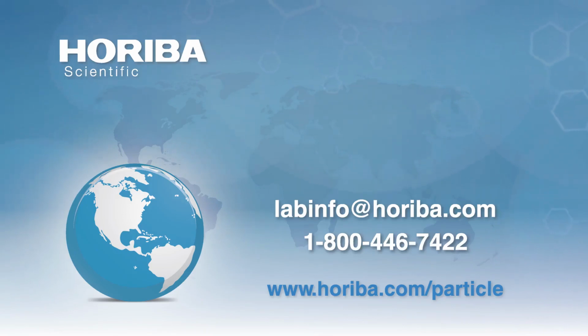Yes. So, if you have an aqueous solution and it contains a strongly absorbing molecule in it, I think vitamin B does this to me. It absorbs strongly, I think it absorbs the blue or the green, I forget which. And so you might be forced to turn down the laser power because of that. That doesn't happen a whole lot. A more common request we get is with an organic liquid.